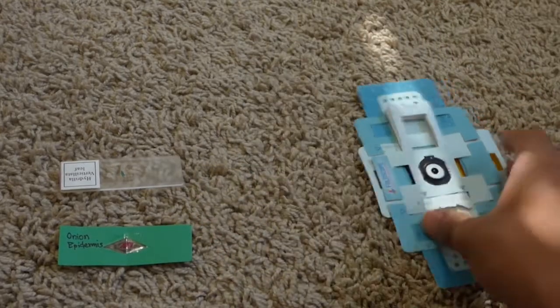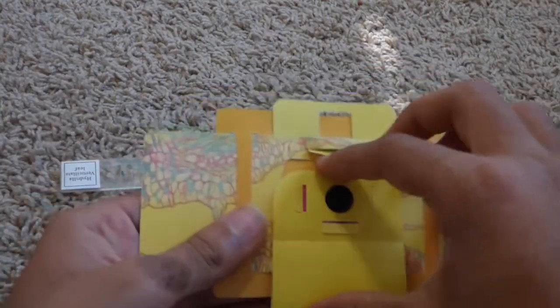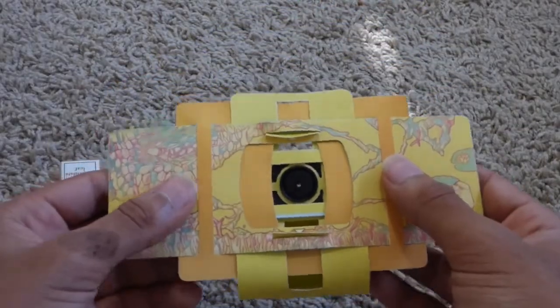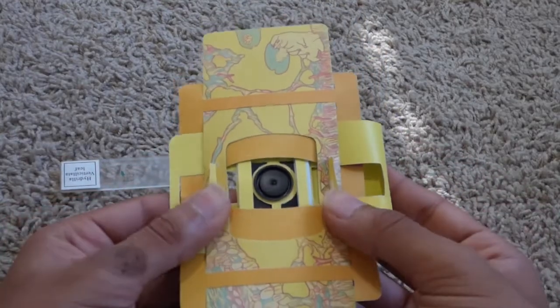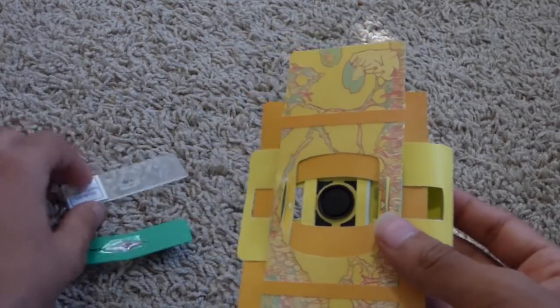So first, I'm going to gather my Foldscope and turn it around to the yellow side. There's this back flap right here, which all we have to do is open. Once we open the back flap, you'll see that there's two little slits right here, with some arrows on them. This is where you're going to need to insert your slide.